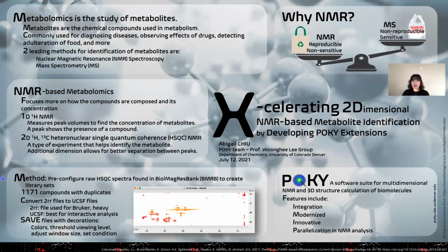The spectra on the right is an example of what it would look like if a researcher overlaid standards onto the unknown. The light brown region is glucose. As you can see, since it's right on top of some of the peaks in the unknown sample, this means that there must be glucose in the unknown sample. Another possible match in the sample is HEPES. Since the yellow peaks match the known peaks in the spectra, then it's most likely going to be HEPES.